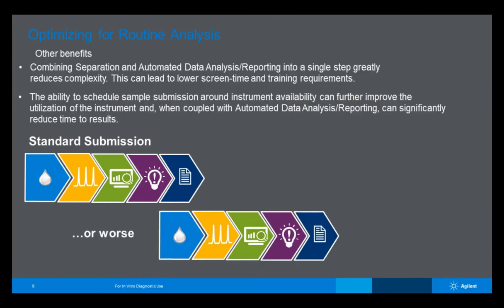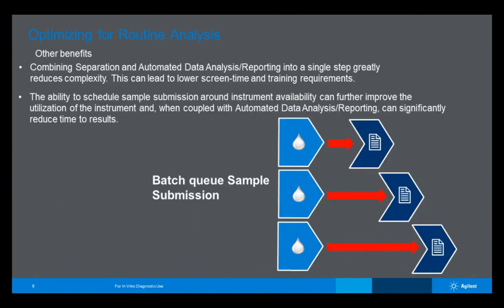However, there may be a worse situation where the single workstation, which is used for acquisition and chromatographic separation, is the same workstation that's utilized for the data analysis, interpretation, and reporting. In that case, you can see how the sample submission has been greatly elongated and the time to results has really suffered too. So that's the worst case scenario.